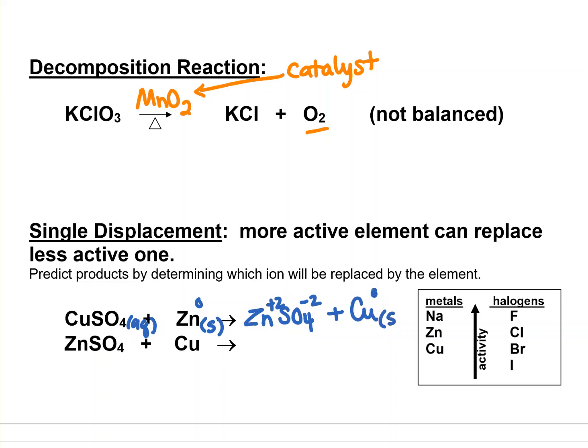And I'm going to tell you, it is a solid. It's sometimes hard to observe that solid, but it is a solid there. If you let this react for a while, you will see these gold little flakes or copper colored little flakes, maybe orange, floating on the top, the surface. And if they float there and you look carefully, they're shiny orange and they're kind of cute. But anyway, so there's that reaction. It appears to be balanced.